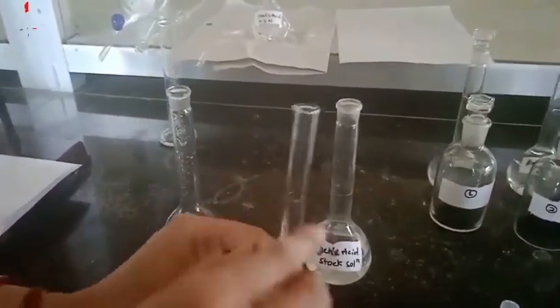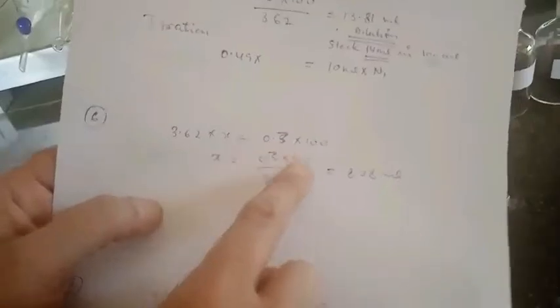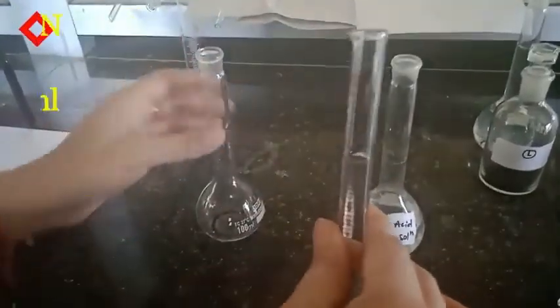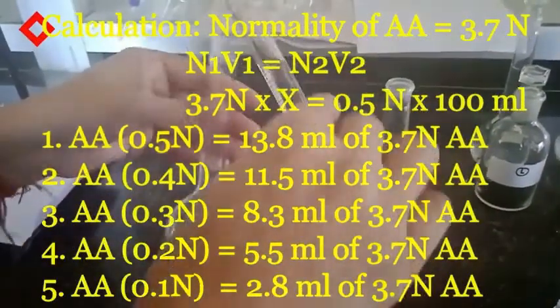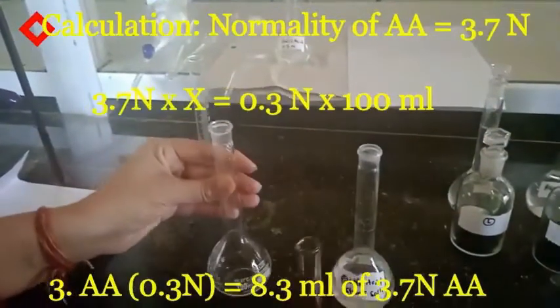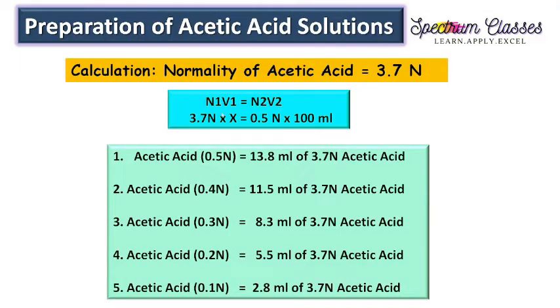against 0.5 normal NaOH, and I have prepared different concentrations of acetic acid, 0.5 to 0.1 normal, by the dilution method. In this much I have taken. So if you want to really know, then you can see in detail in the previous video, right? So by the dilution method, how we are going to perform this or how we are going to prepare these concentrations.